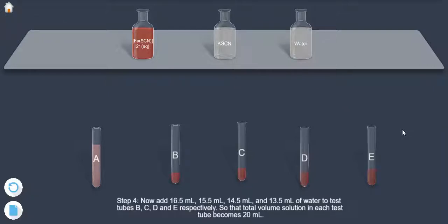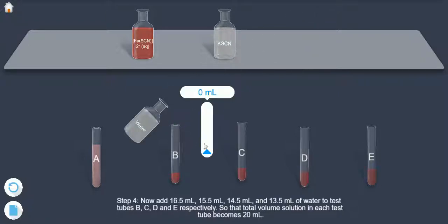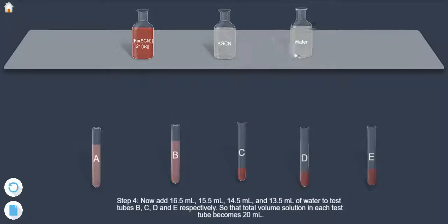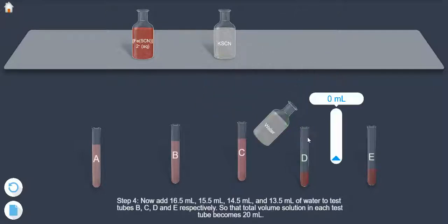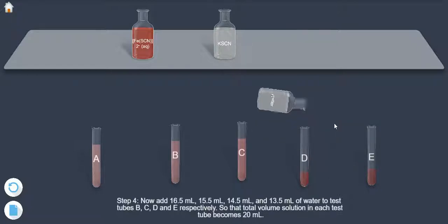Step 4. Now add 16.5 ml, 15.5 ml, 14.5 ml and 13.5 ml of water to test tubes B, C, D and E respectively, so that total volume solution in each test tube becomes 20 ml.